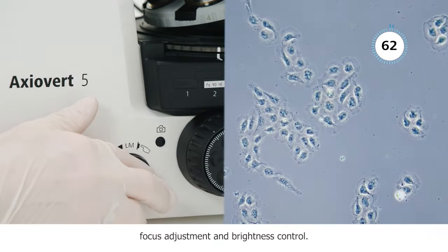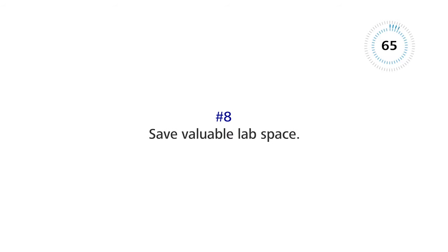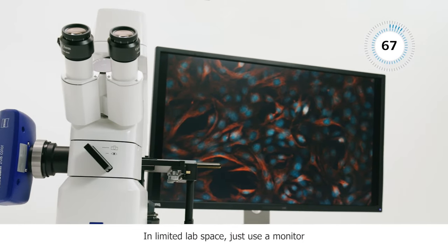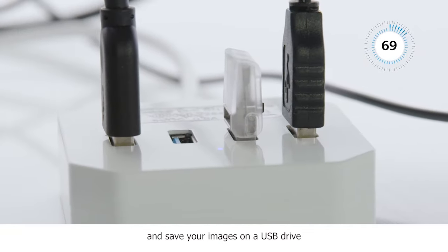In limited lab space, just use a monitor and save your images on a USB drive without extra computer or software.